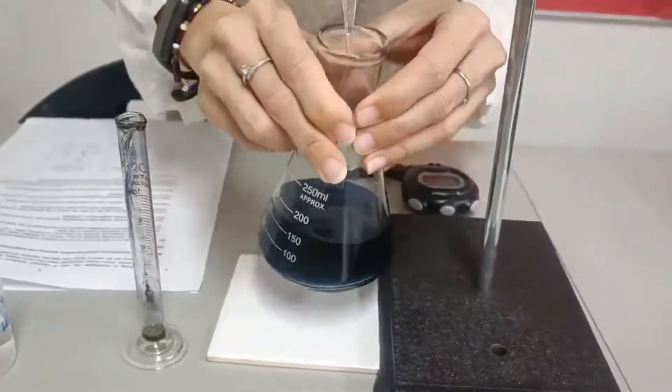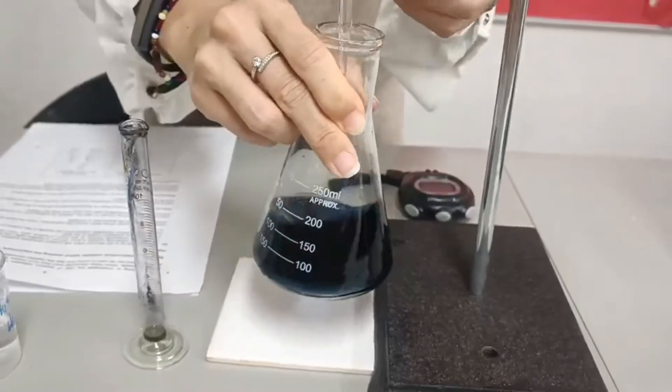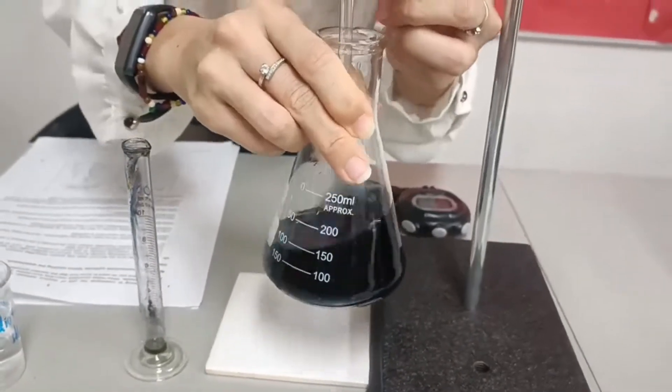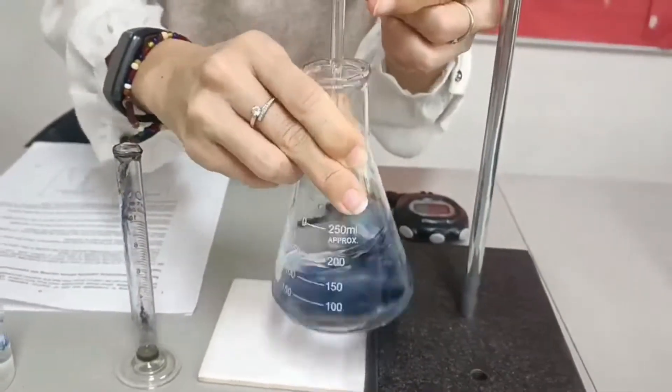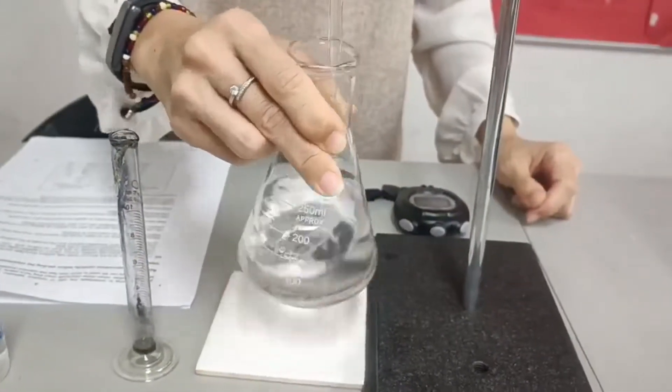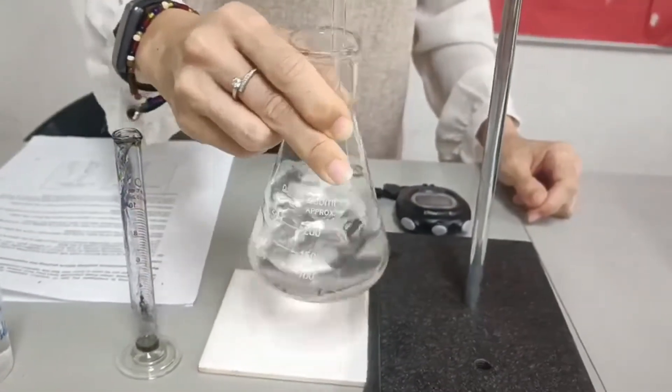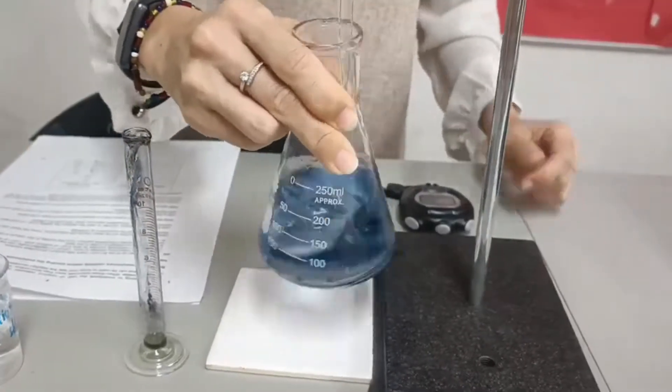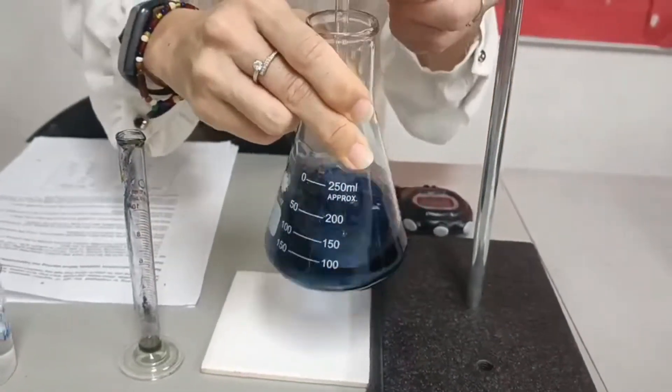And then, now, while still swirling, you add half a ml of thiosulfate solution. Keep on swirling and notice the time when it turns to blue. That's your second reading. Take it down.